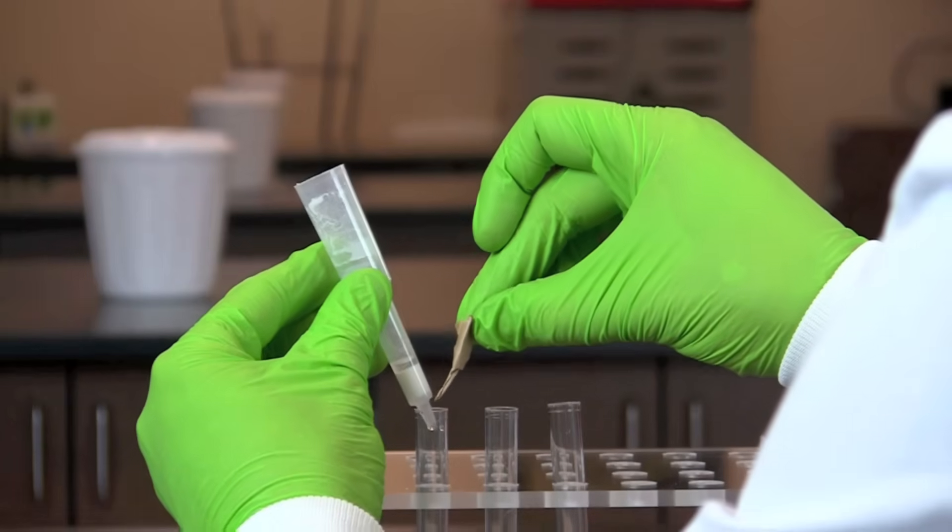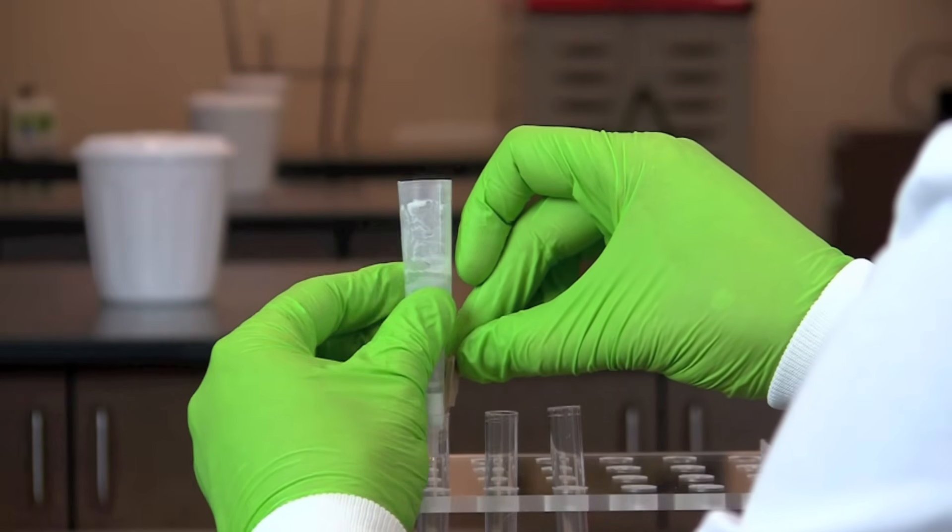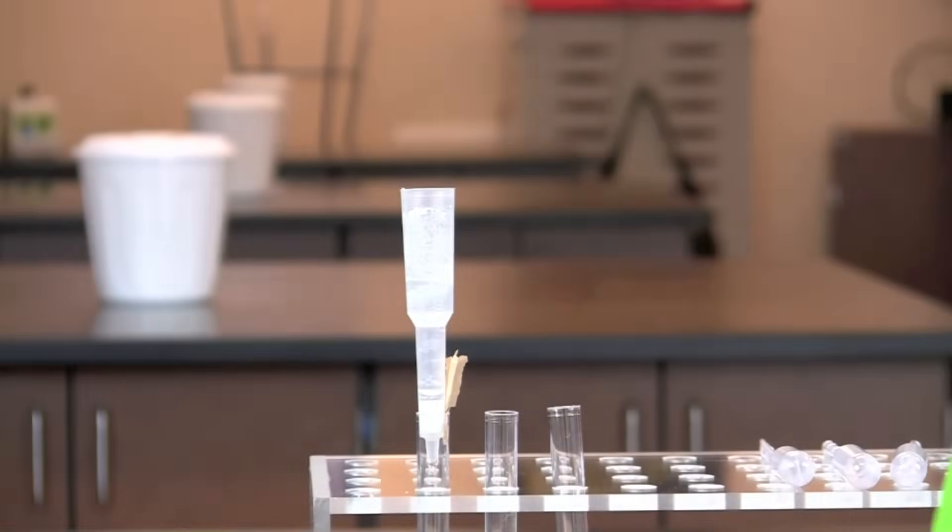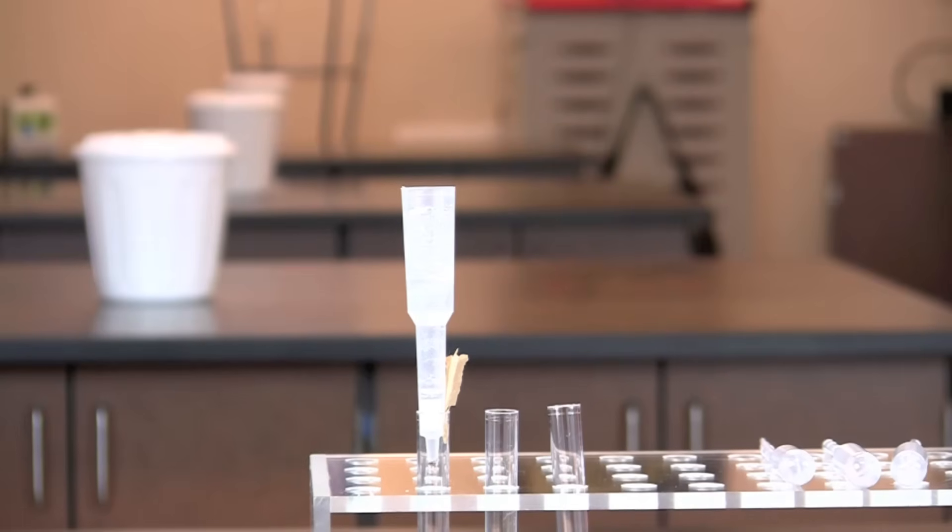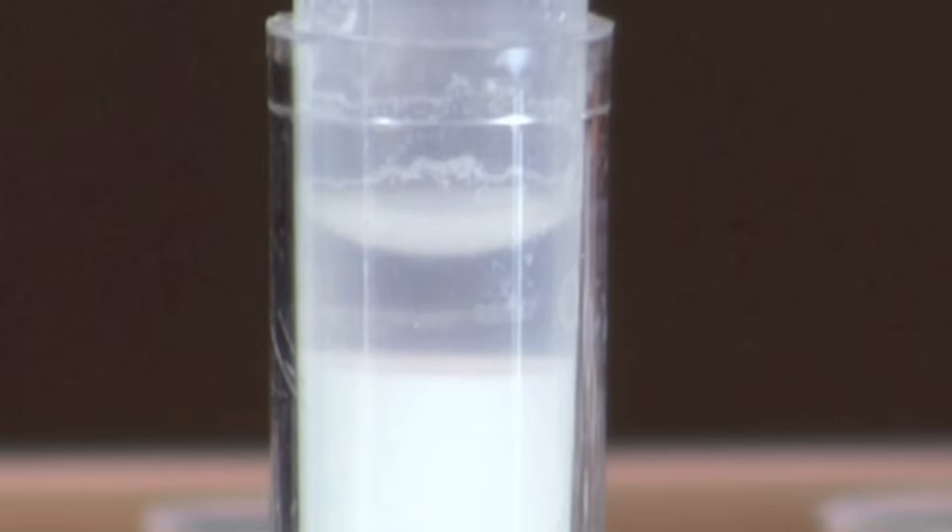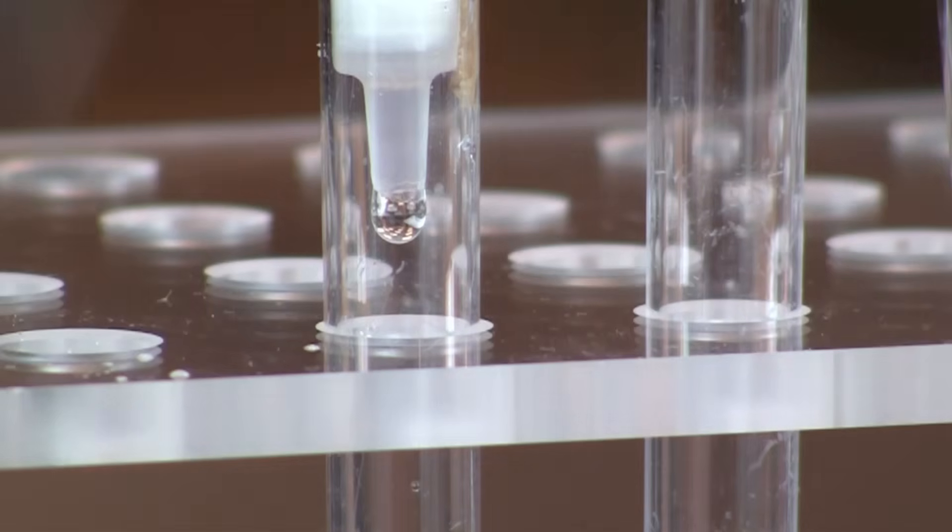Insert a small wedge of paper between the column and the collection tube to prevent the formation of an airtight seal, which would slow the flow of the sample through the column. Allow the column to drain the storage buffer in collection tube number one until the bottom of the meniscus is one to two millimeters from the surface of the resin.